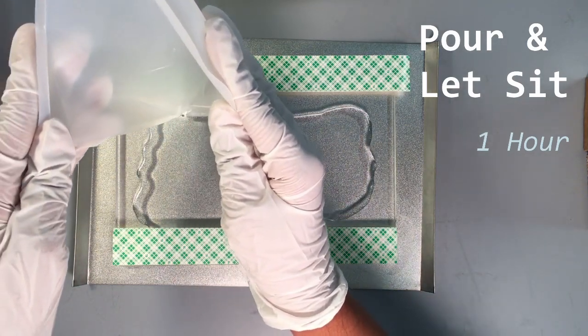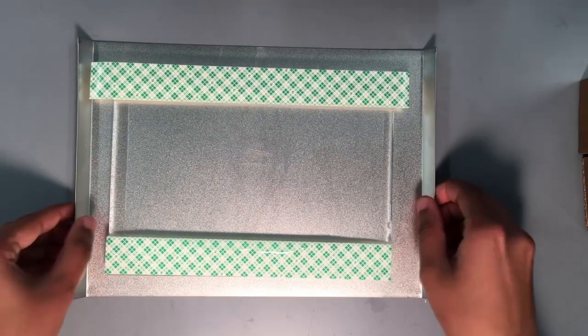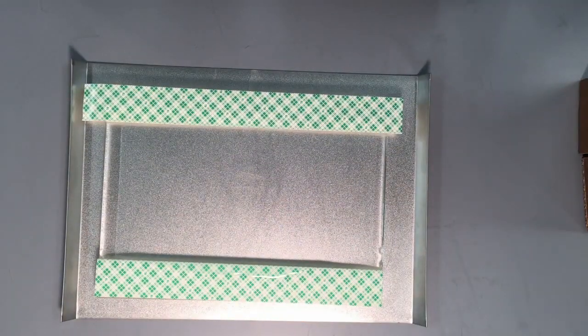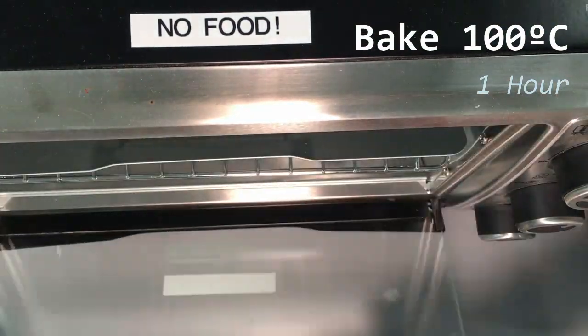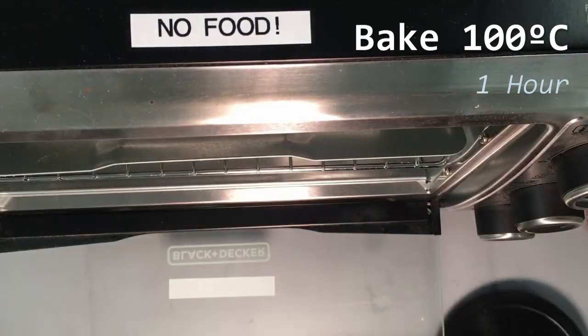Leave the mixture to sit for 1 hour. Preheat your oven to 100 degrees Celsius and place your tray inside. Cook the PDMS for 1 hour.